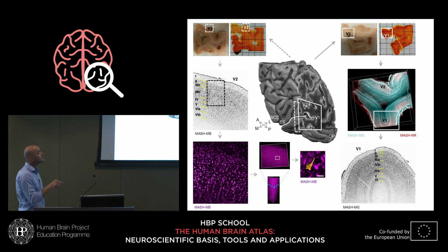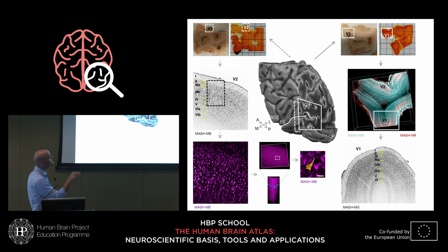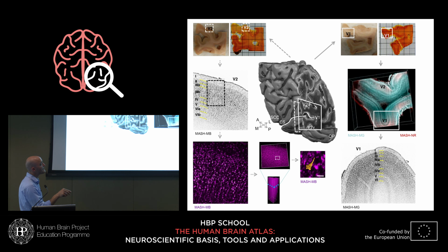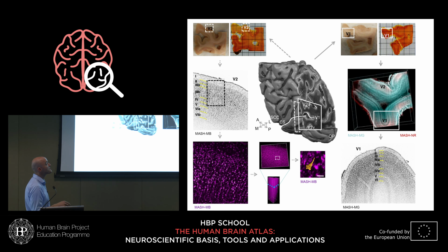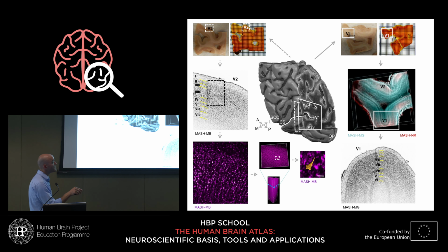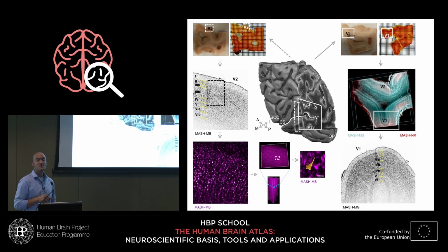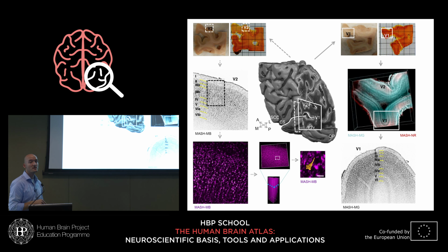On the front block of tissue over here, you see it after clearing, with the combined nuclear stain and cell body stain. We can get entire fields of view that cover multiple cortical areas, but we can also subsequently, with the light sheet microscope, zoom in enough to get single cell level signal that is sufficient for us to do the entire cytoarchitectonic classification of that tissue, correlated to where the MR signal would be.